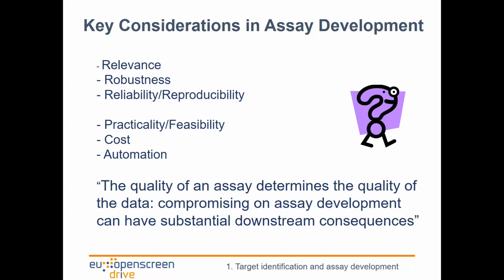And I would like to finish with this sentence that is here, that is extremely important. To spend a lot of time developing the assay is extremely important because this later gives us very good results, and with these results we can move forward. But if we develop a very quick assay and we don't obtain robust results or quality data, we lose the time. We lose the reagents, we lose the time, and we don't have any answer in our hands. Okay, this next slide.